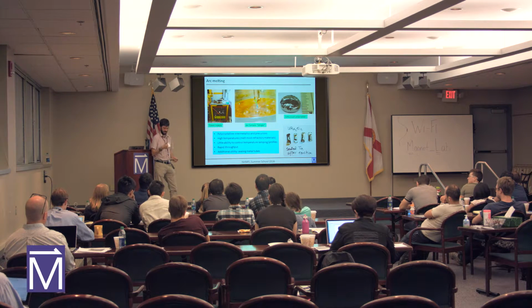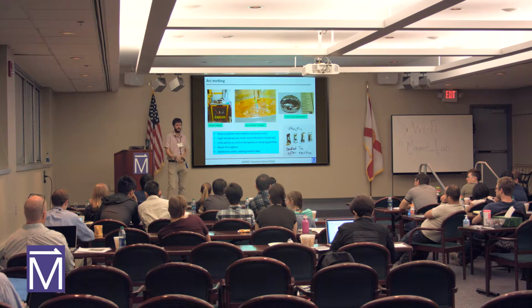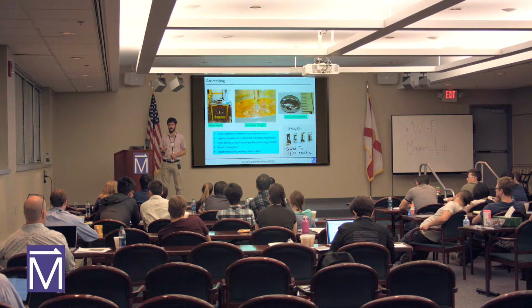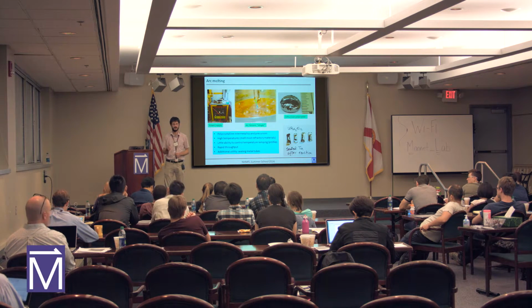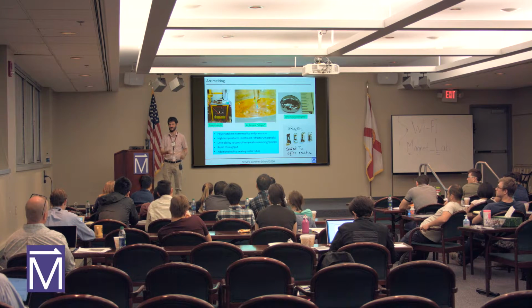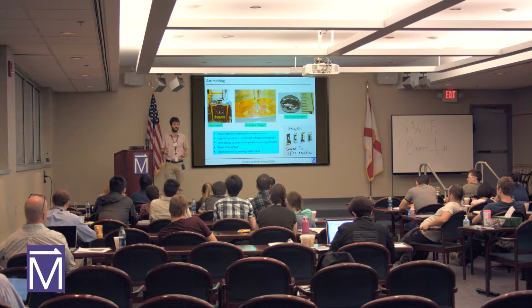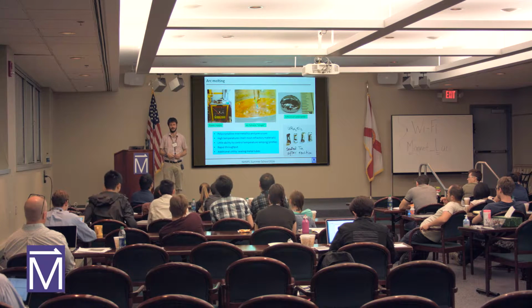It could be as big as my thumb. You could. The thing you're going to encounter if you try to put an alumina crucible in one of these is that it's possible. You can buy that size tantalum, but it's expensive. But before you even think about using an alumina crucible, look at the binary phase diagram of tantalum and the other stuff. If there are no phases forming below your growth temperature, then you don't even have to worry. Tantalum is very non-reactive with a lot of things. It reacts with some things, but a lot of times you can get away with a lot.